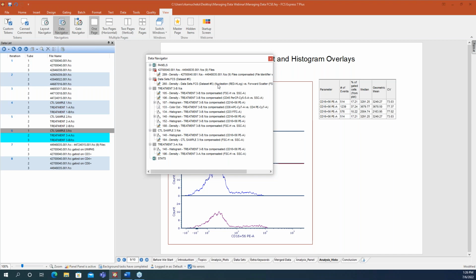And it also is very helpful if anytime I see that these have deactivated, because everything downstream, after I've built my analysis layout and I've done my batch actions, everything comes back to the iterations and how we move those data files through our data analysis.